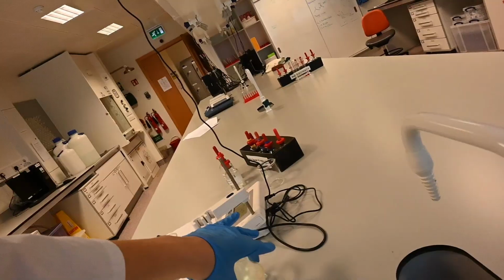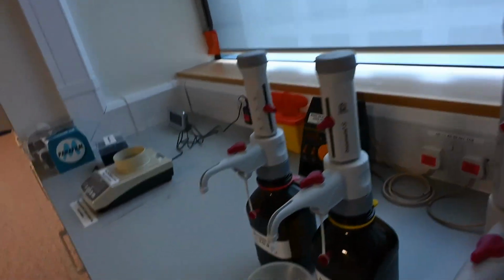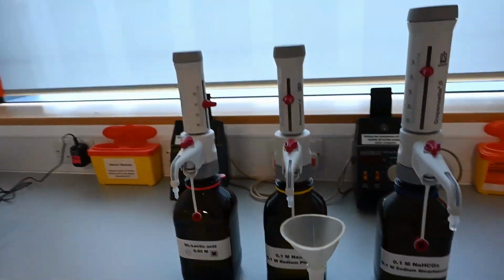Also, now that I'm thinking about it, I also recommend using a funnel. So we're going to take our funnel and we're also going to bring it over here. Perfect. So it should be set up like here first.